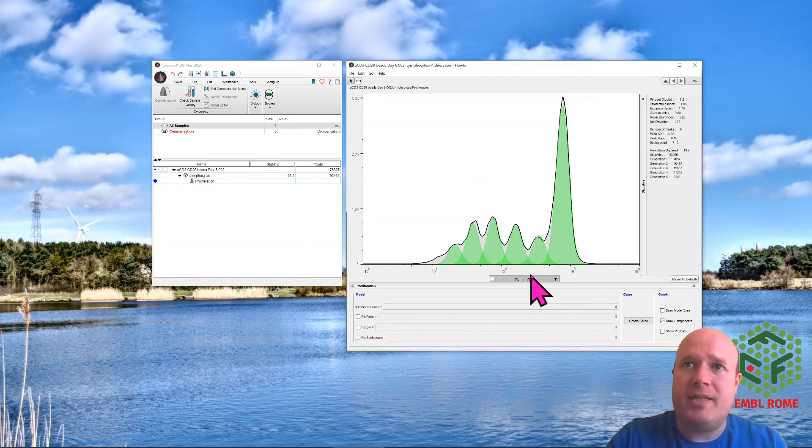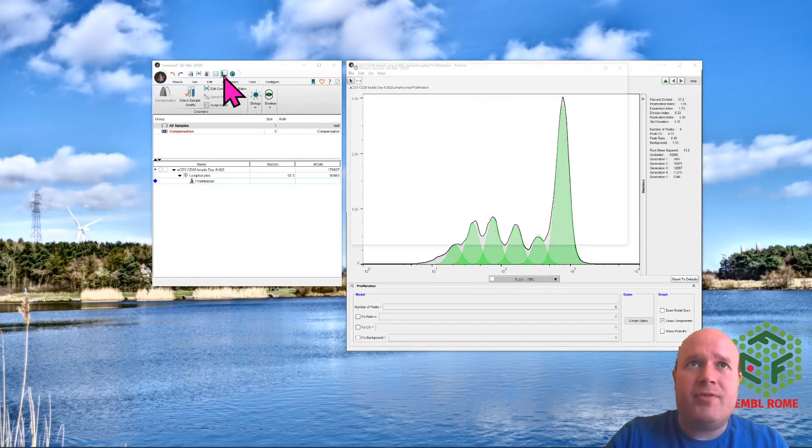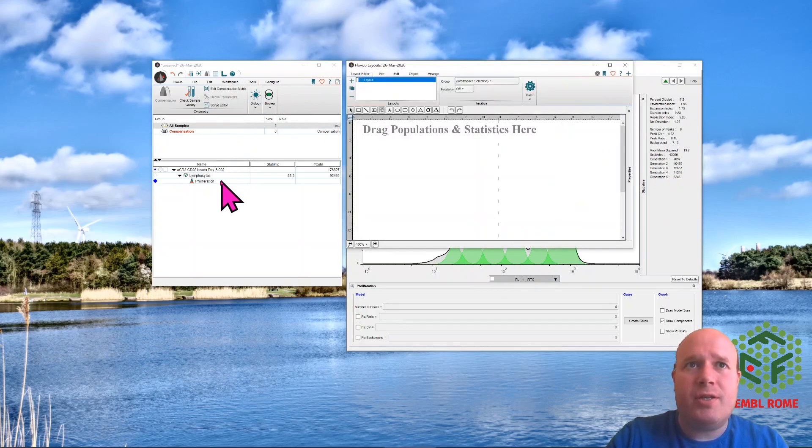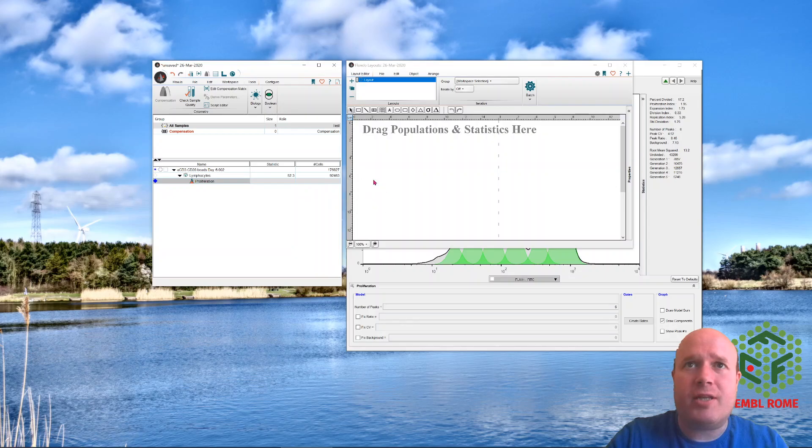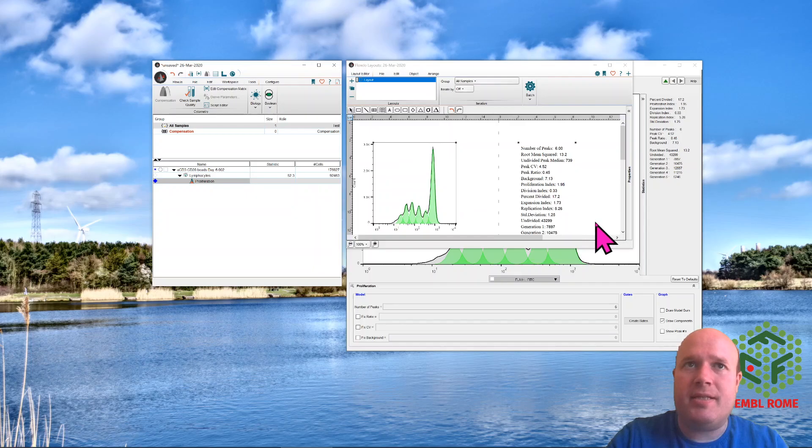So there we go. It's found all six peaks quite nicely. We have the data over here. To get the data out, if you want the image, you just use the layout editor and drag the proliferation population across. And here's the picture, and here's all the data.